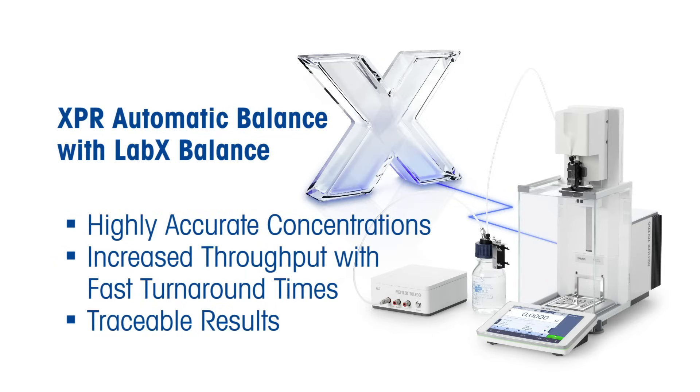Make the shift to preparing solutions gravimetrically with Mettler Toledo and benefit from highly accurate concentrations, increased throughput with fast turnaround times and fully traceable results.